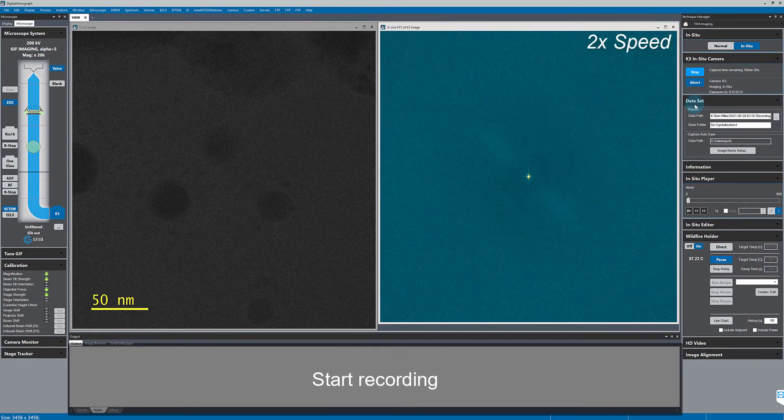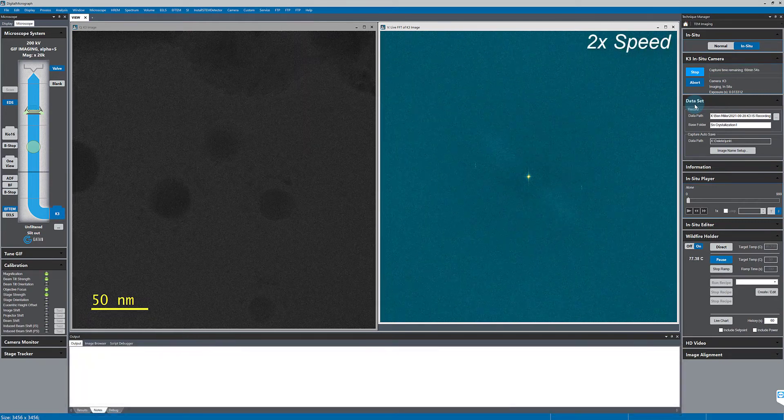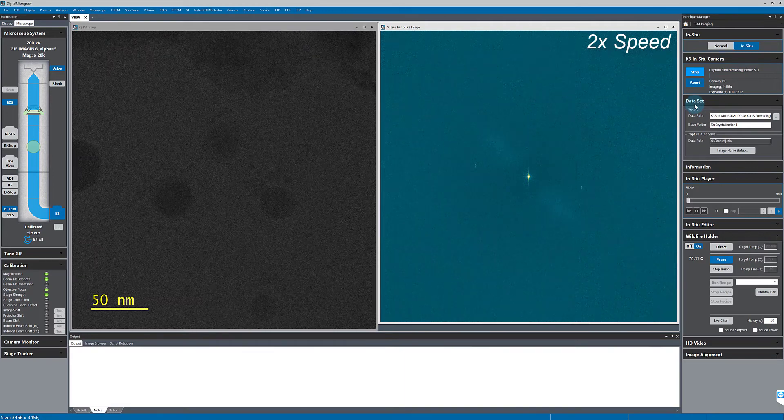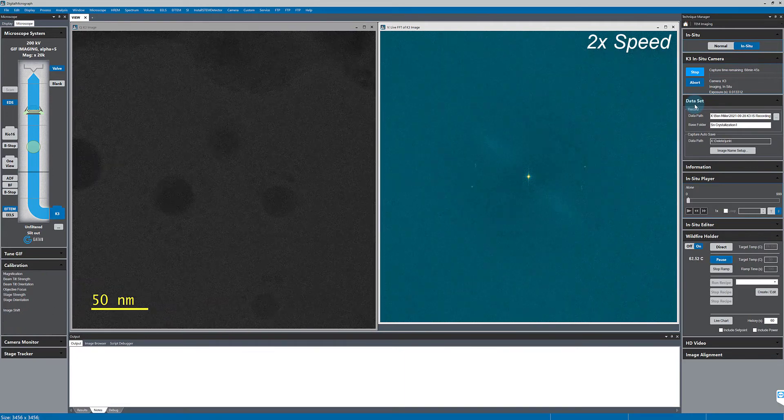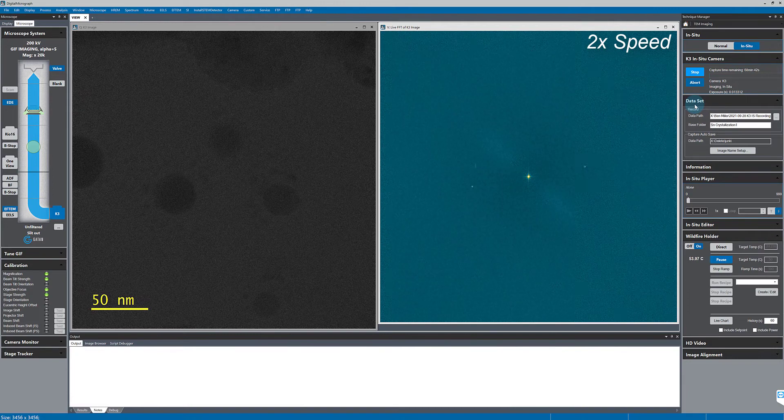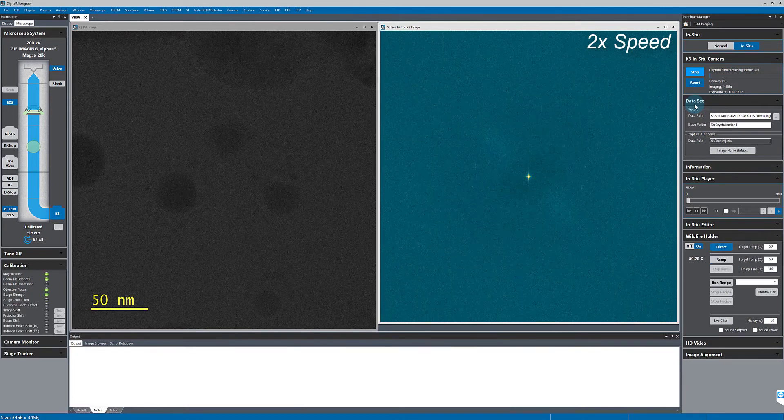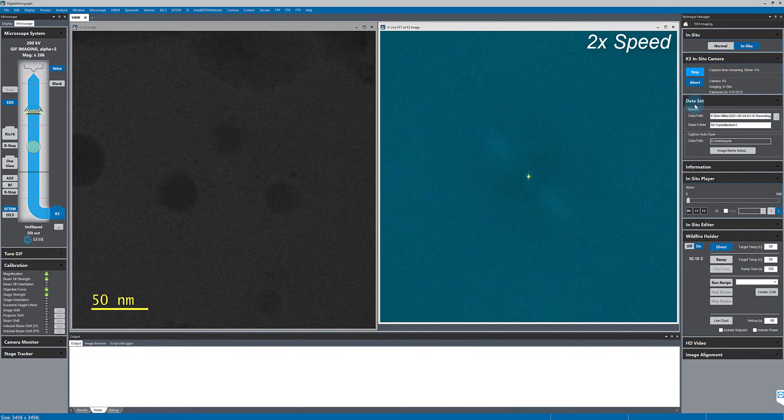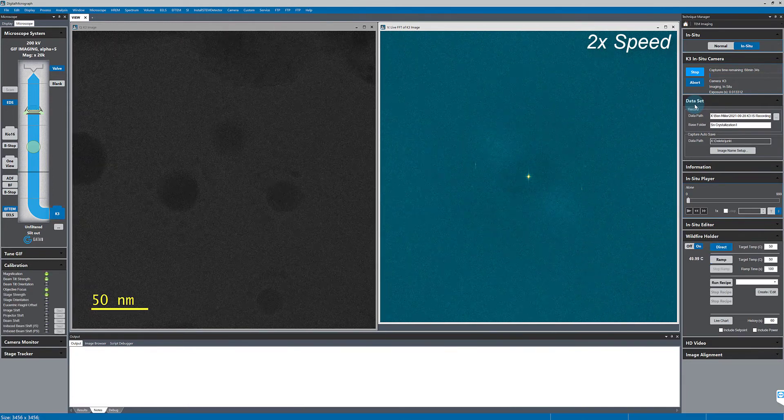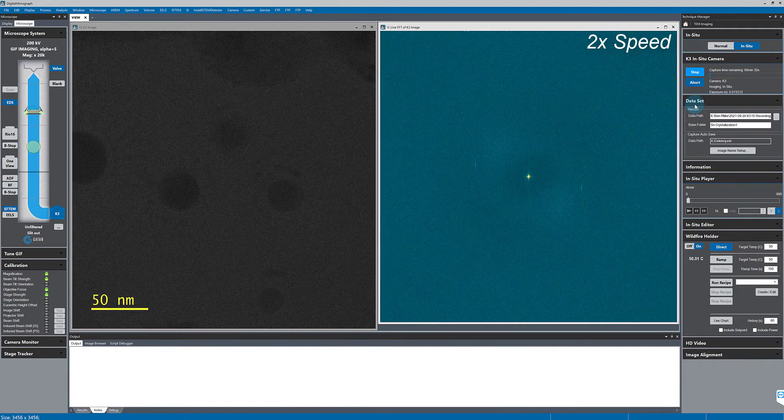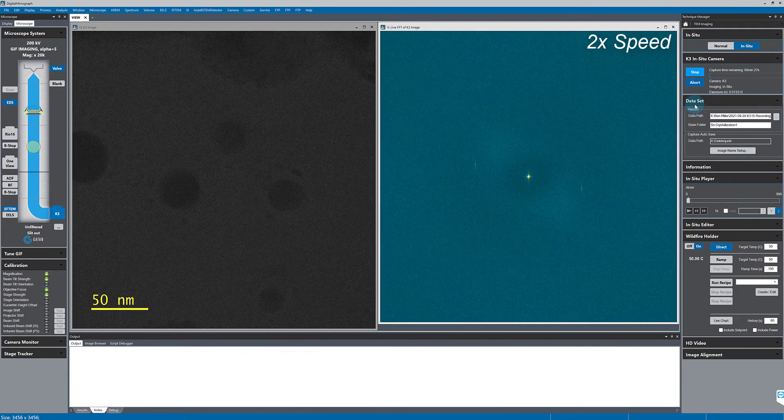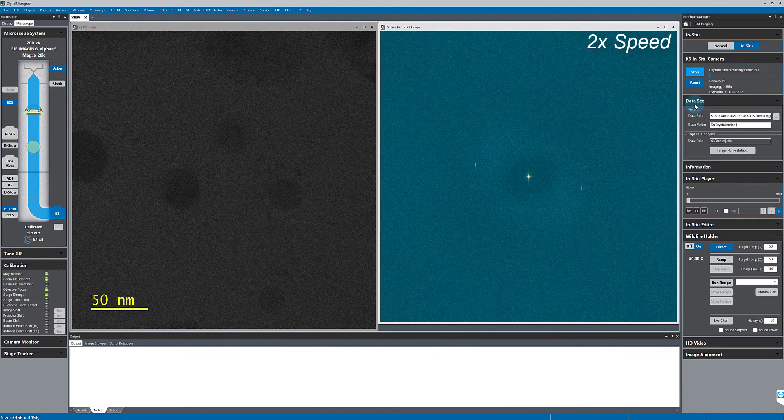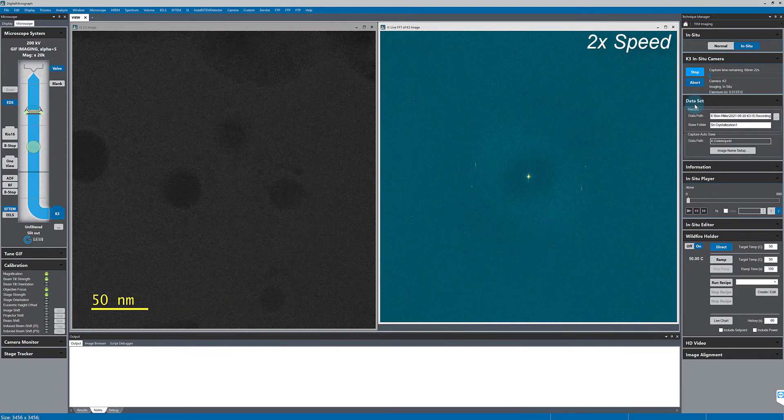And again, I'll speed up the playback of my screen capture here as this part is a bit tedious to watch. Now, my temperature ramp has stopped, but I will give the sample a bit of time to reach equilibrium and stop moving before I stop my in-situ video acquisition.